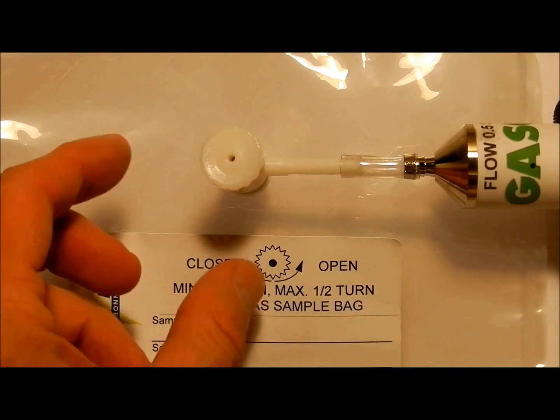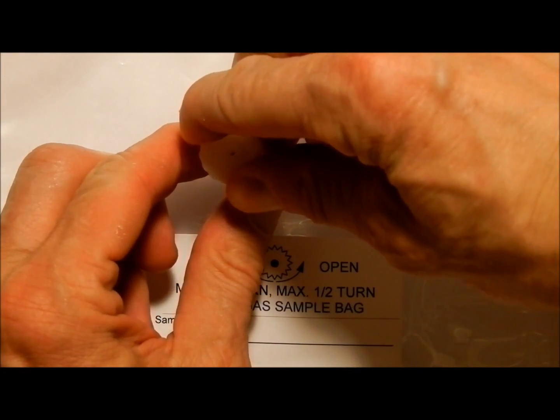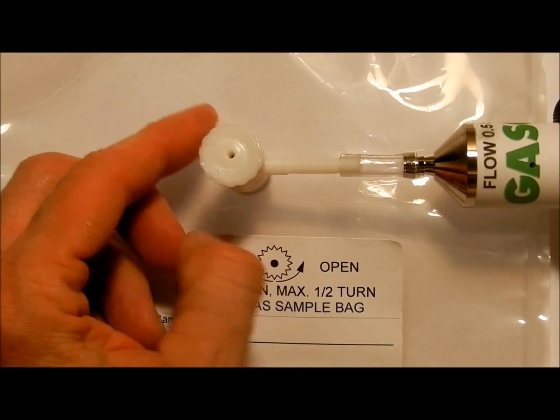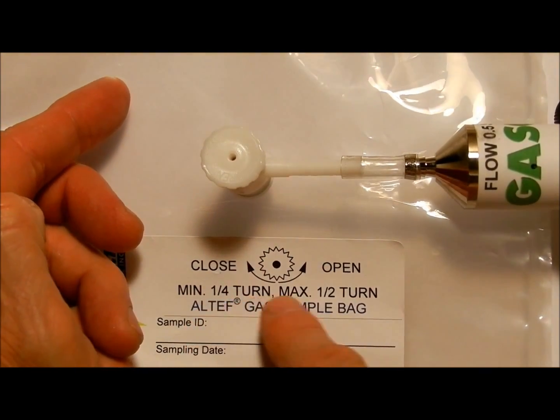To operate the valve, hold the stem firmly and rotate the cap counterclockwise by one quarter to one half turn at most. Do not exceed one half turn or you may cause a leak in the valve.